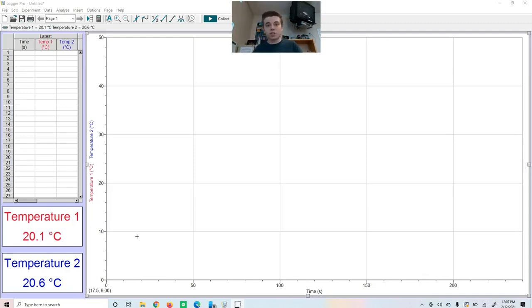For the molar mass, you'll just find the molar mass of each of those substances. We provided you the chemical formula for everything except for water. Water is just H2O, in case you forgot that. Then you'll have to ask yourself, is there a hydrogen bond or is there not a hydrogen bond? Remember, to have a hydrogen bond, you have to have an H bonded to an O, an H bonded to an N, or an H bonded to an F. So I'm going to go finish getting things all set up and ready, and then we will start our first trial.